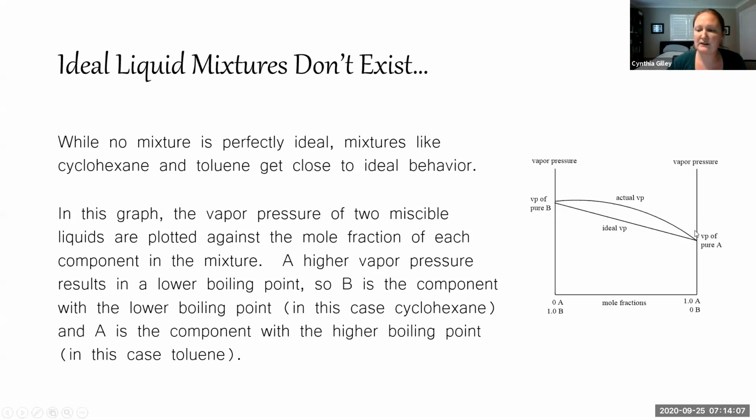So, and just to relate that, which we will later, again, to boiling point, compounds that have a higher vapor pressure have a lower boiling point, meaning, right, if they have a tendency to break free and can get into that gas phase easier, then their boiling point will be relatively lower. Okay, so on the x-axis, what do we have?